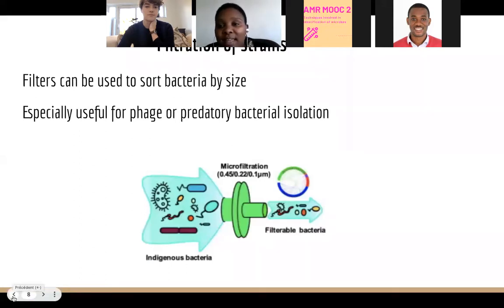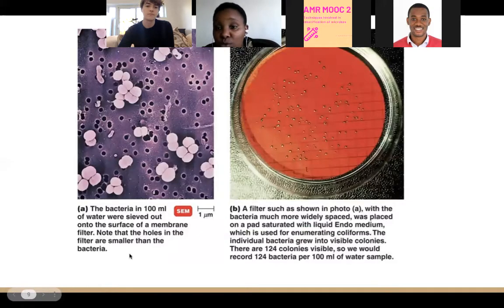But there are cases where you have too much sample, and you cannot just go around and test the whole of your thousands of mils, for example. So what you have to do is use filters with a pore size smaller than the size of your microbes of interest, and filter the samples to obtain the filtrates. Then you can take them either to the microscope and observe what you see, or you can take them for culture so that you can see what grows out of your filter.